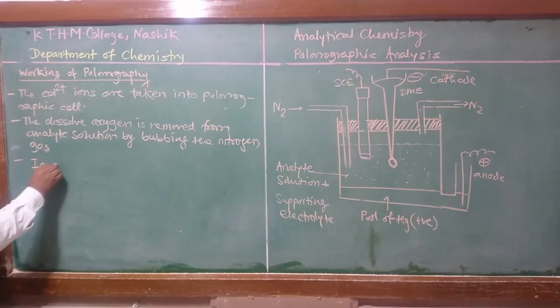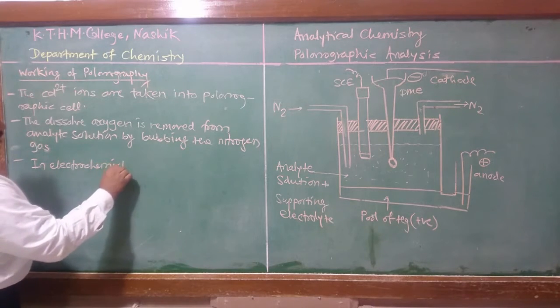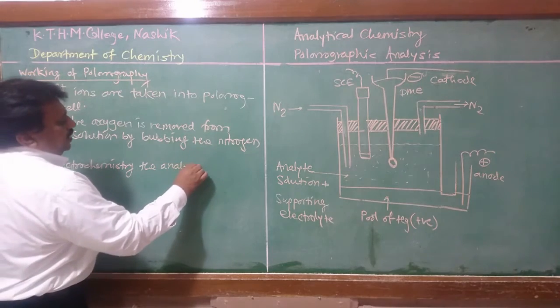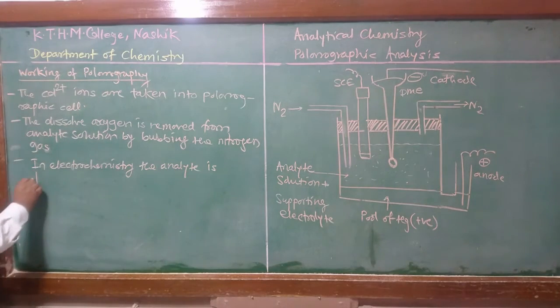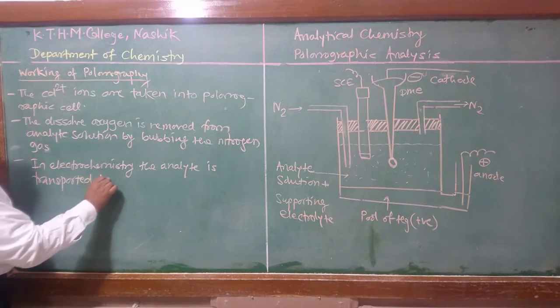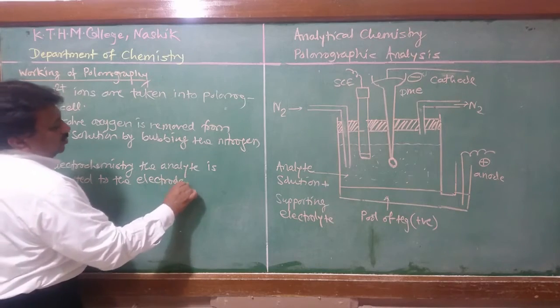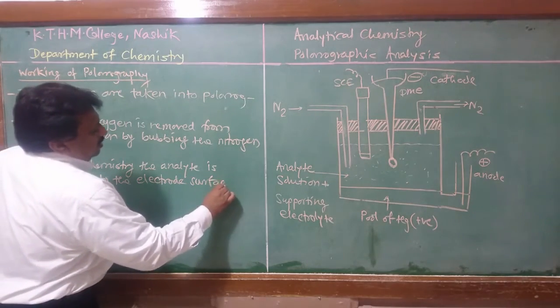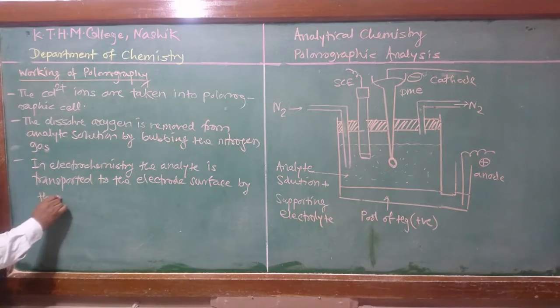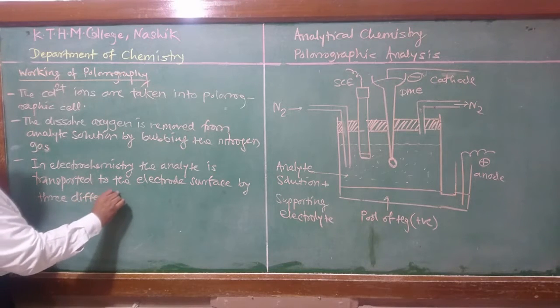In electrochemistry, the analyte is transported to the electrode surface by three different phenomena.